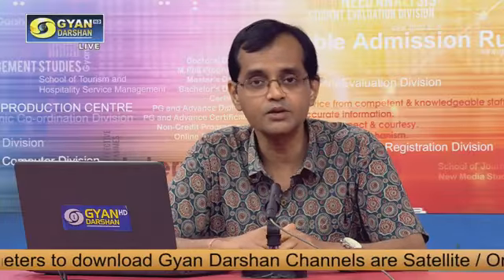Because this is a practical session, today's discussion is mostly based on the laboratory experiments, so we will focus our attention mostly on the principles, and then we will take a look at the procedure, that is how do you go for this kind of work, what are the protocol steps for isolation, and then the observation, and finally the precautions.